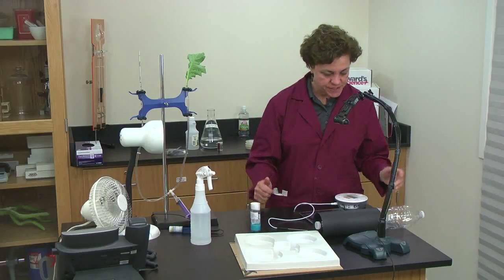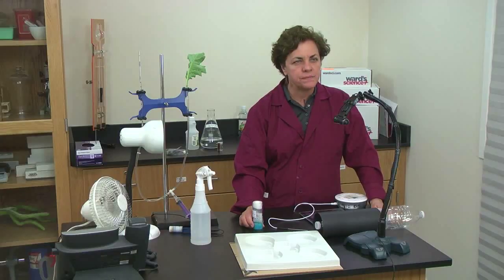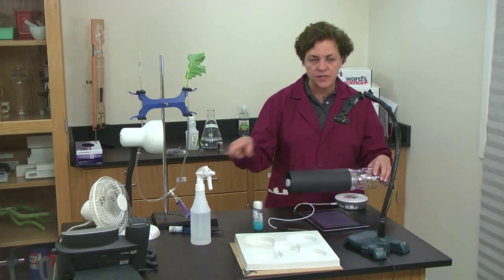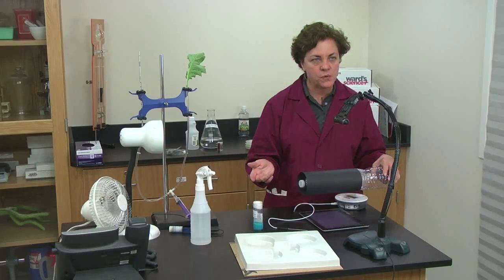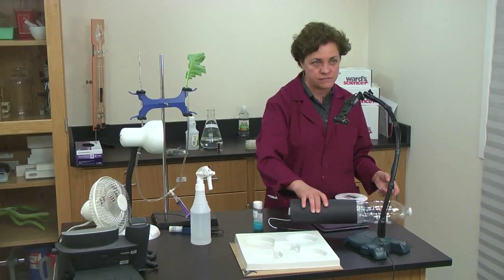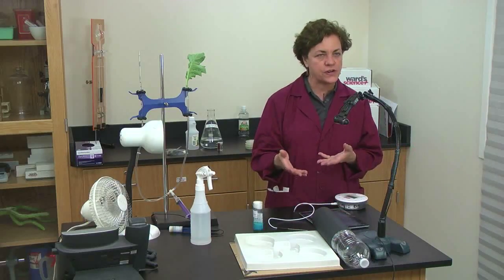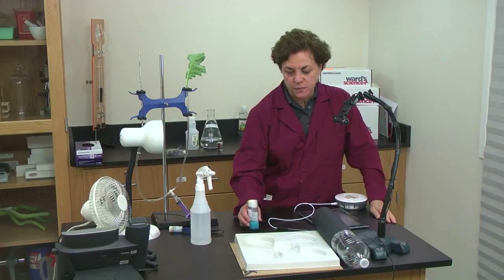All right, let's see. Another one that I have listed here, you can test the light. If you want to try light on it, between it, you can try relative humidity. You could make one side more damp than the other. You can do the external temperature that I just talked about. You can see whether the attraction changes for any of those variables when it's cooler or warmer. And the last one that I listed there was pH.